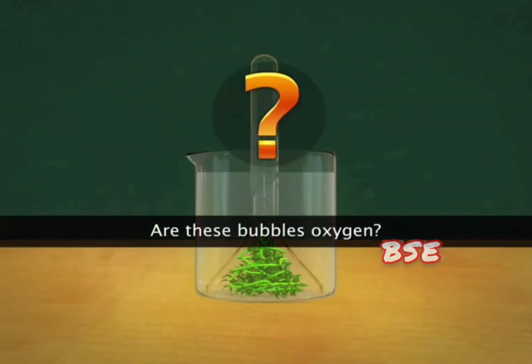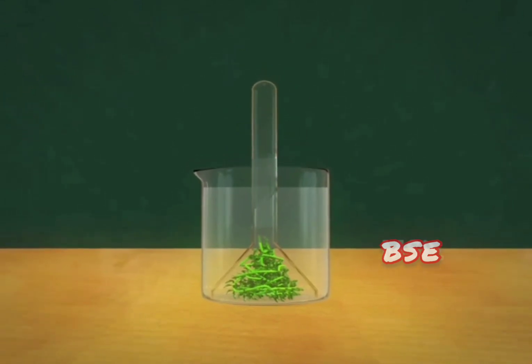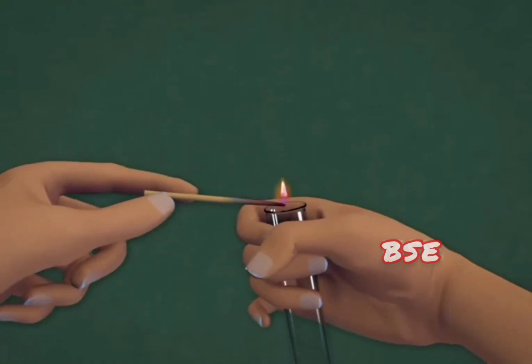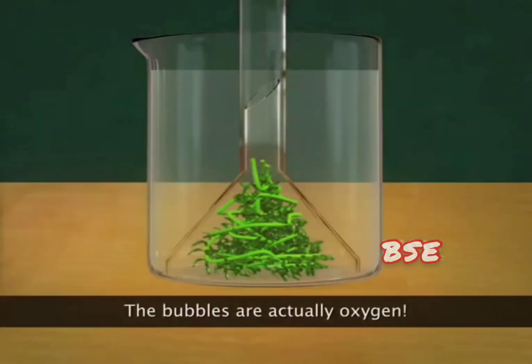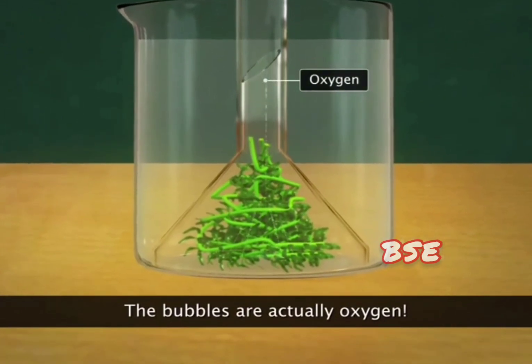But how do you confirm that the bubbles released are oxygen bubbles? There's a solution to it. After bubbles collect in the inverted test tube, carefully remove the tube and place a glowing splinter in the test tube. The splinter will light up with a flame. Oxygen in the tube helps ignite this flame. This proves that oxygen was produced as a result of photosynthesis of hydrilla.